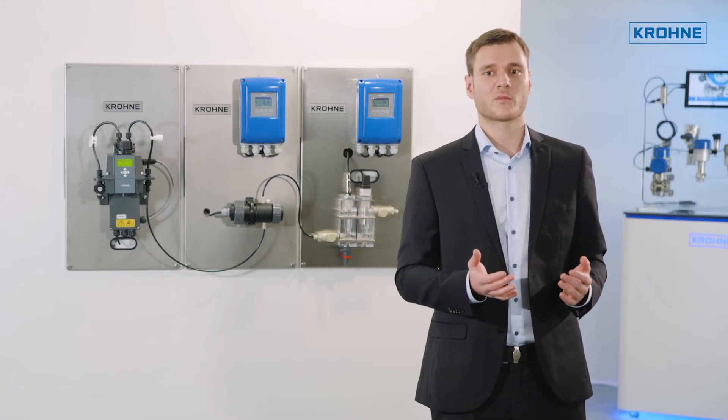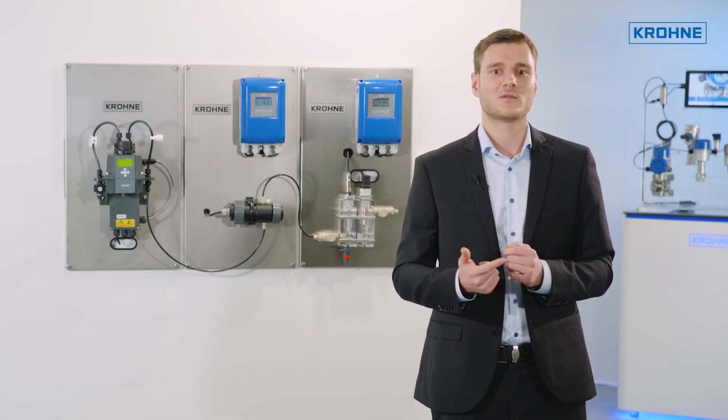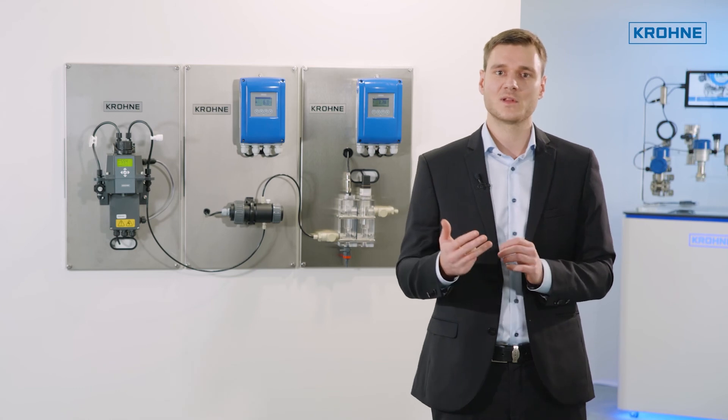The new panel modules from KRONE are available for measuring dissolved oxygen, conductivity, redox potential, and, as already mentioned, turbidity and pH.